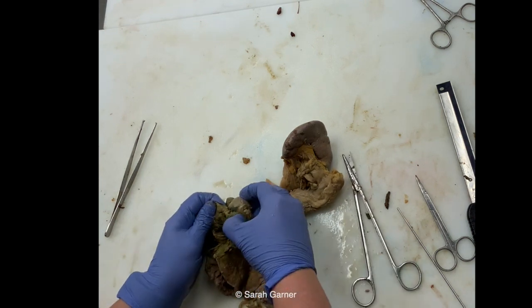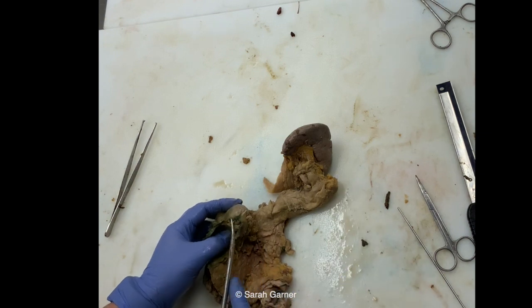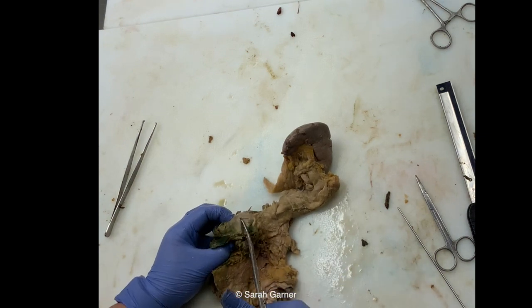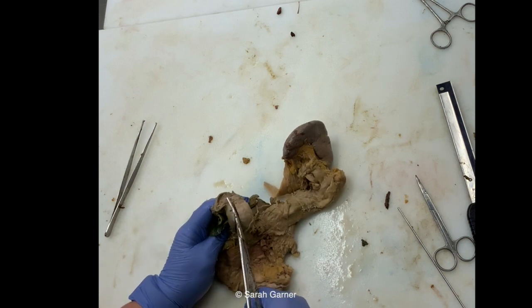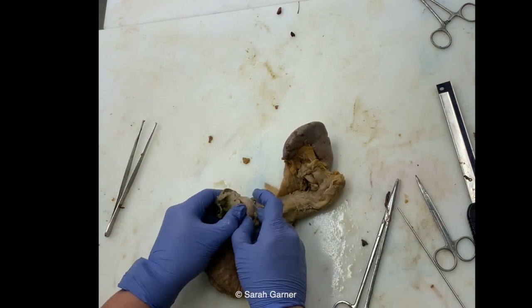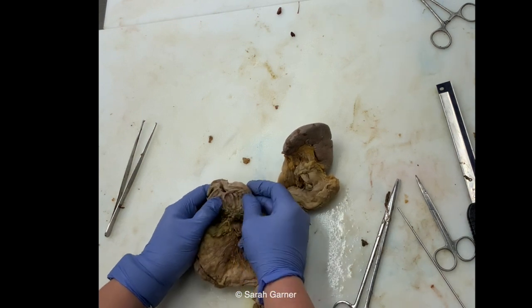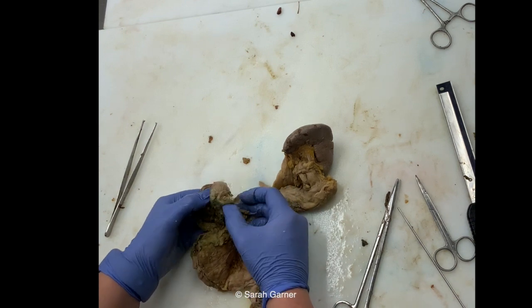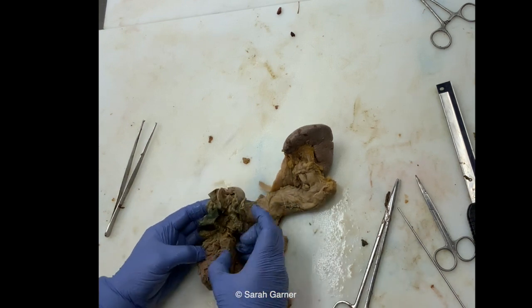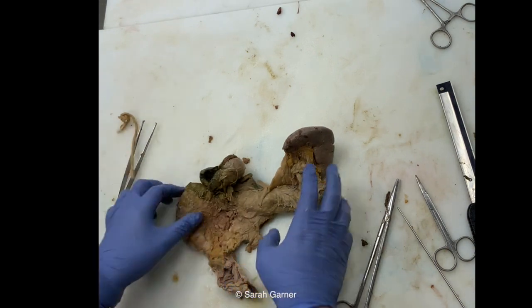So, geez, this is super thick here. Right, so there's your pyloric sphincter. See how thick that is? That's the pyloric sphincter. There's the transition to duodenum. Boom, right there. So I'll rinse this out a little bit so you can see it a little bit better, and then we should be able to cut it open.